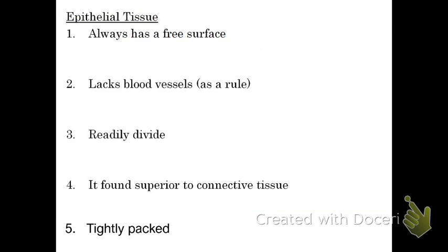Now, there are 5 important characteristics of epithelial cells that I want you to know. One I've already mentioned. They are tightly packed. Okay, starting at the bottom here. So these cells are tightly packed. They are touching each other.